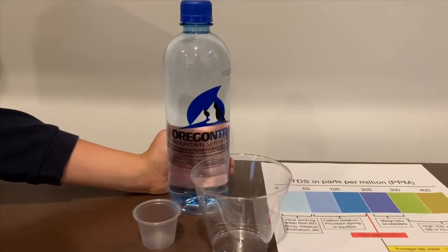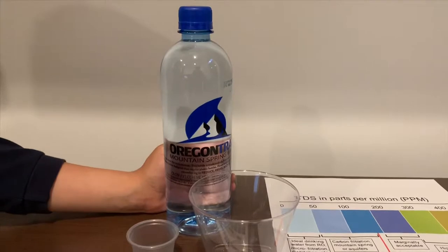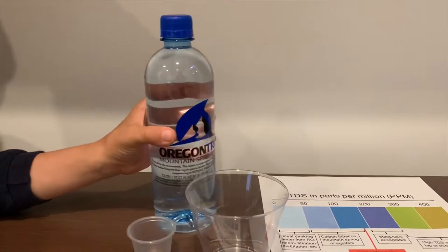This is Oregon Trail Mountain Spring Water. It's sourced from Oregon and it costs $2.95. Let's test the pH and TDS.